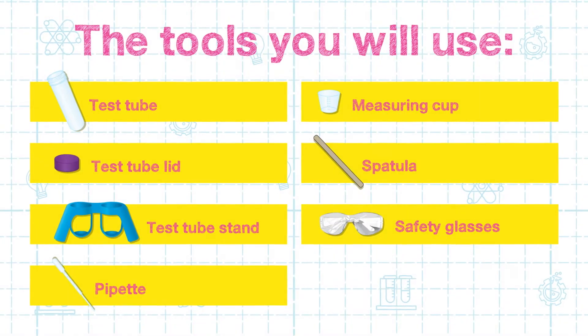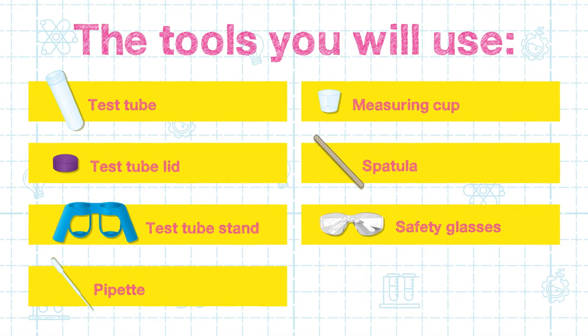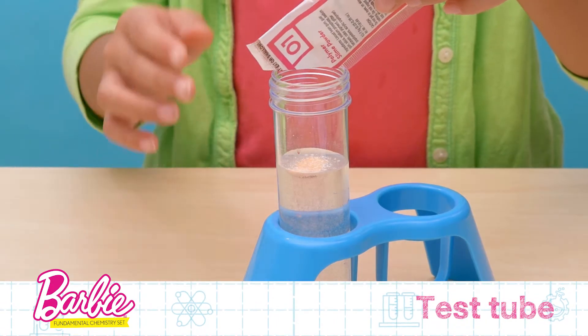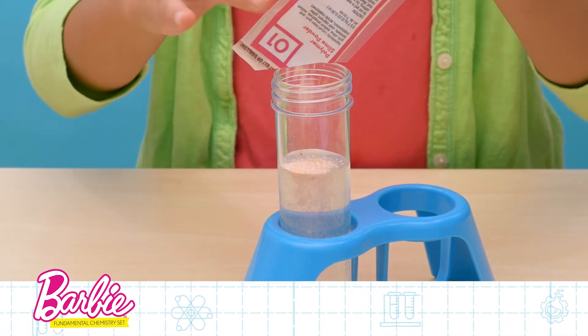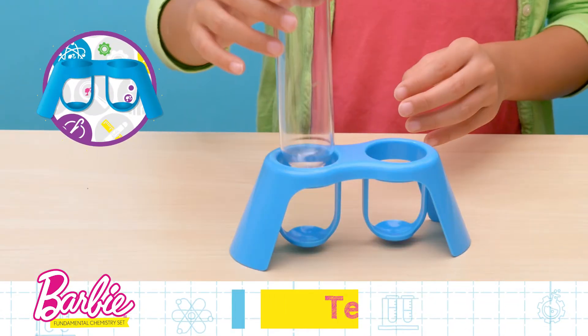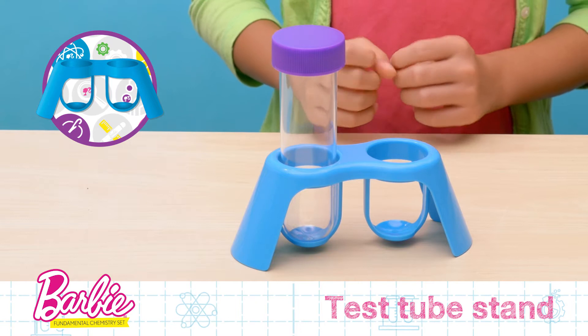Now let's explore the different tools you will use for your experiments. This is a test tube. These tubes are used to hold the liquids and powders for your experiments. The test tube lid keeps everything inside, and the test tube stand allows you to keep your experiments upright.